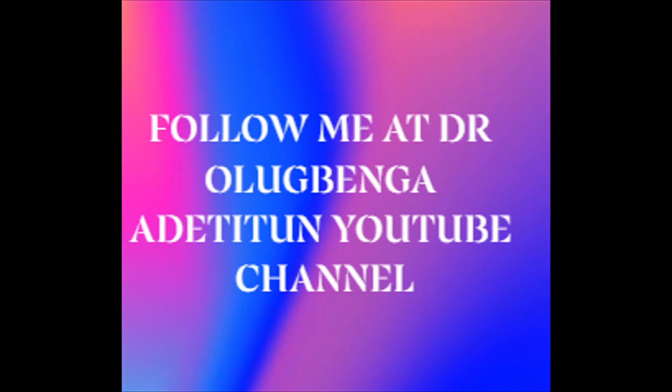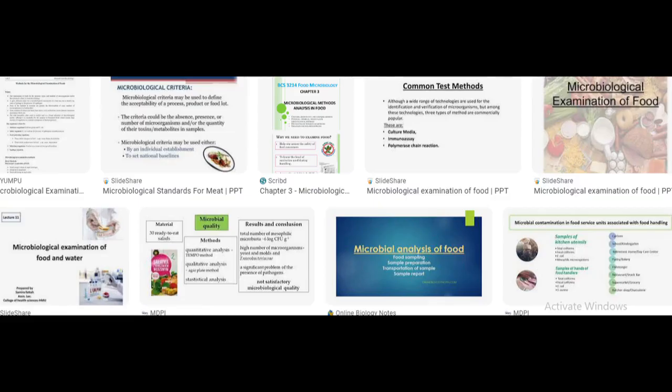So let's look at the alternative method. We have the direct method, we have the visual, we have the microscopy, then we have the cultural method, then we have the MPN. You can see there are different methods. So I'm telling them now, if I get to exam or test, they say, okay, well, list and explain the methods used for this. Don't say you don't know it. We'll be rounding up in 10 minutes. Make sure you understand. If I get to exam now and say list and explain the methods used, you can't say you didn't get it. So it shouldn't be that way.